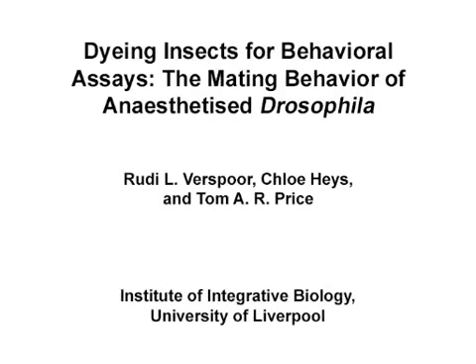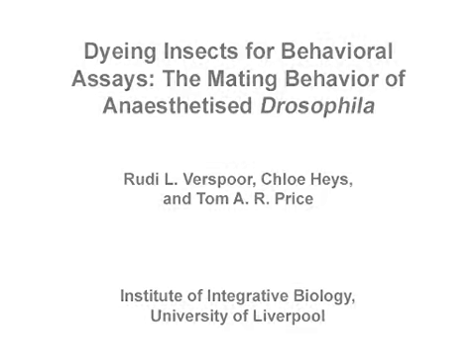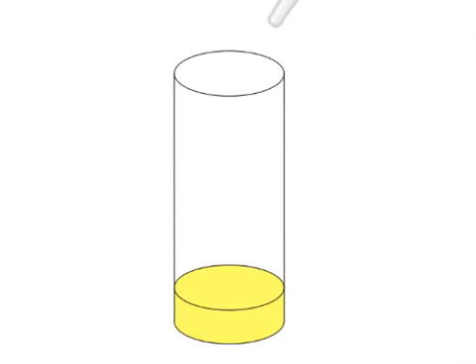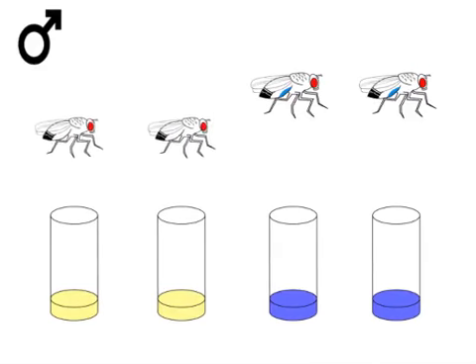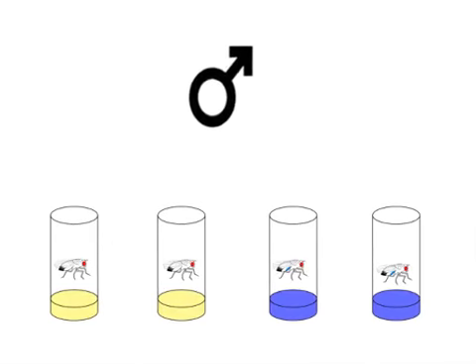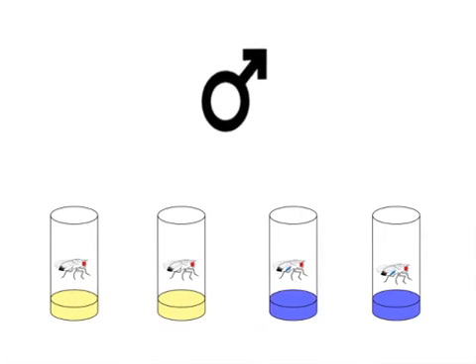The overall goal of this procedure is to make insects visibly distinct from one another in a non-invasive manner for their identification in behavioural experiments. This is accomplished by first visibly staining the surface of normal Drosophila food in a standard fly vial with a few drops of food colouring. Next, the flies are added to the vial for three hours, at which point the Drosophila should exhibit a strong colouring of the abdomen.